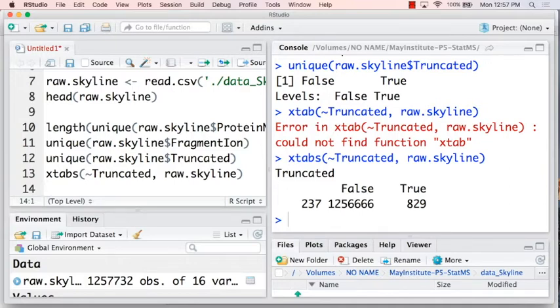Yes? When would you get truncated peaks? I see what you mean by a truncated peak, but when do they occur? So Skyline automatically generates this column. So they already have some report format for everything. They just make an automatic truncated column. I think the question is how it comes about in the first place. Imagine you have a targeted experiment and you schedule your retention time window and you misschedule this. And so the peak moves outside of the time window.